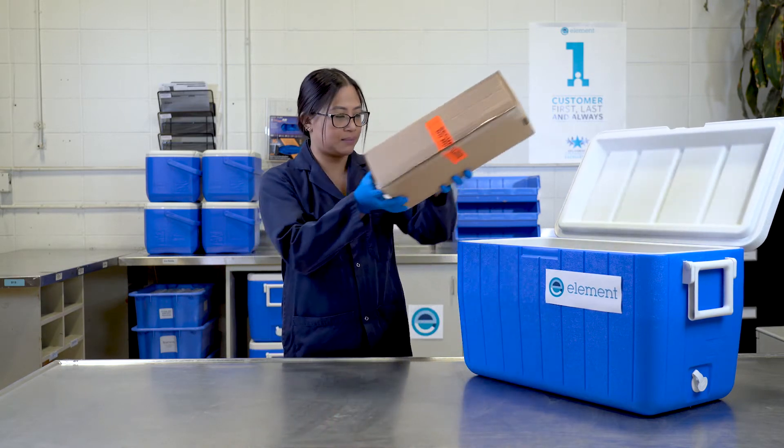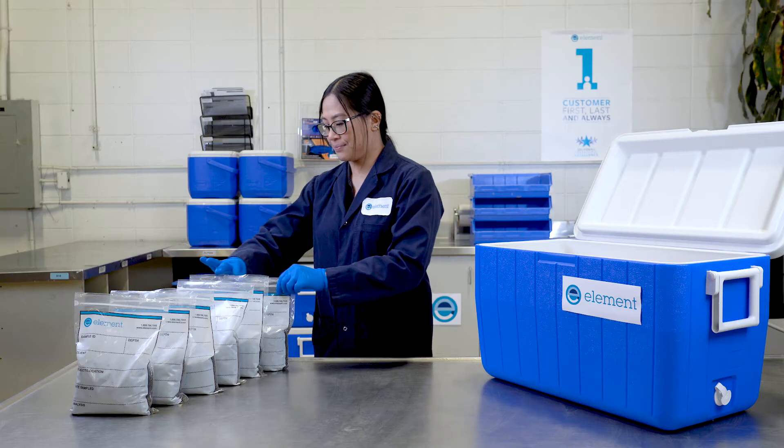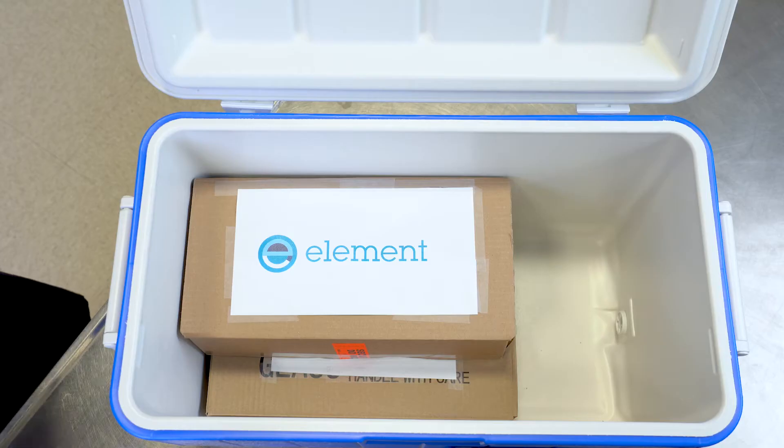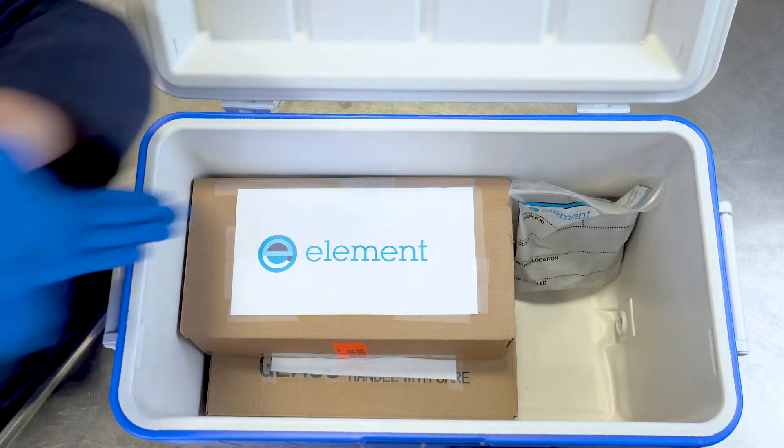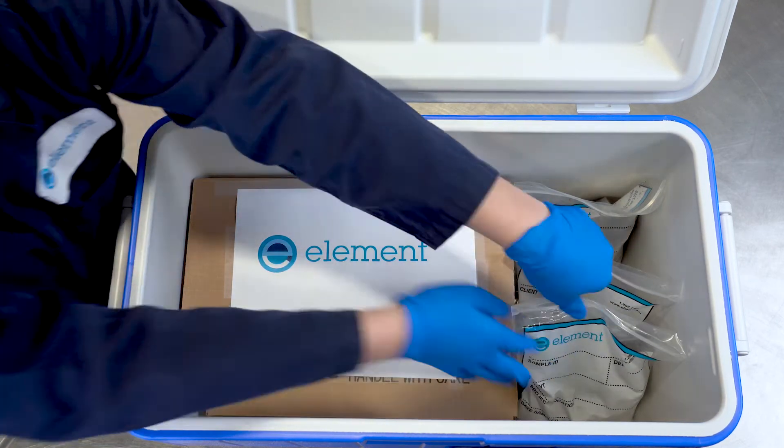Place the jars on the bottom and the box of vials on top. You can now fill the void space with soil bags. The soil bags can act as a buffer for the boxes so they don't shift while in transport as you drop them off or courier the samples to us.